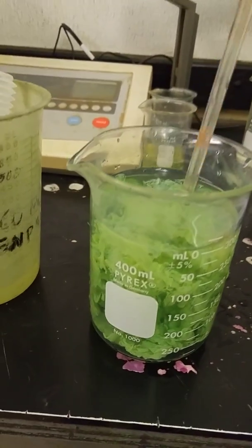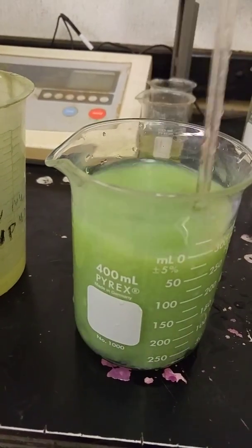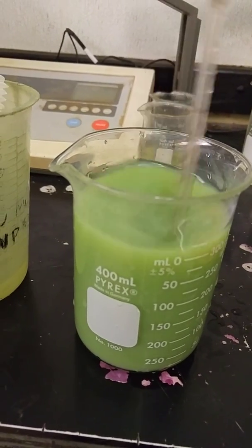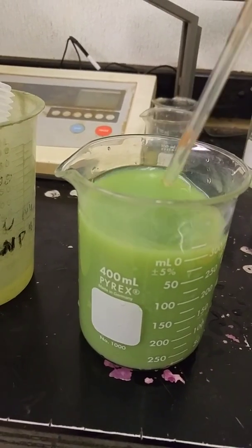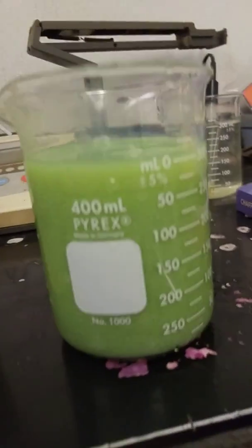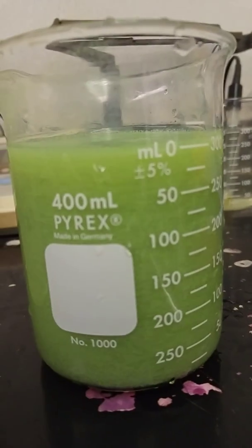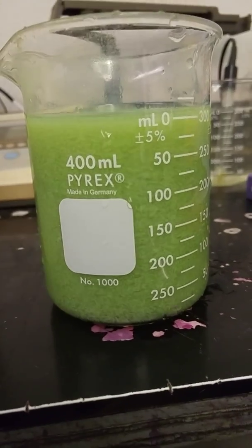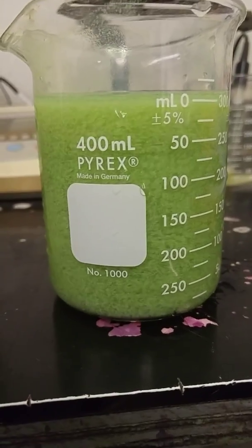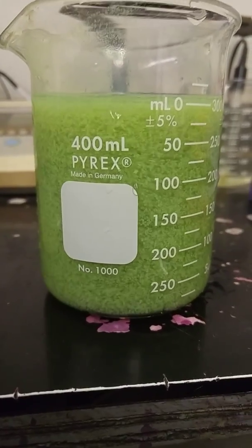I'm going to mix that in there. And now if I get real close you can see all of that floc and nickel floating out in there now.